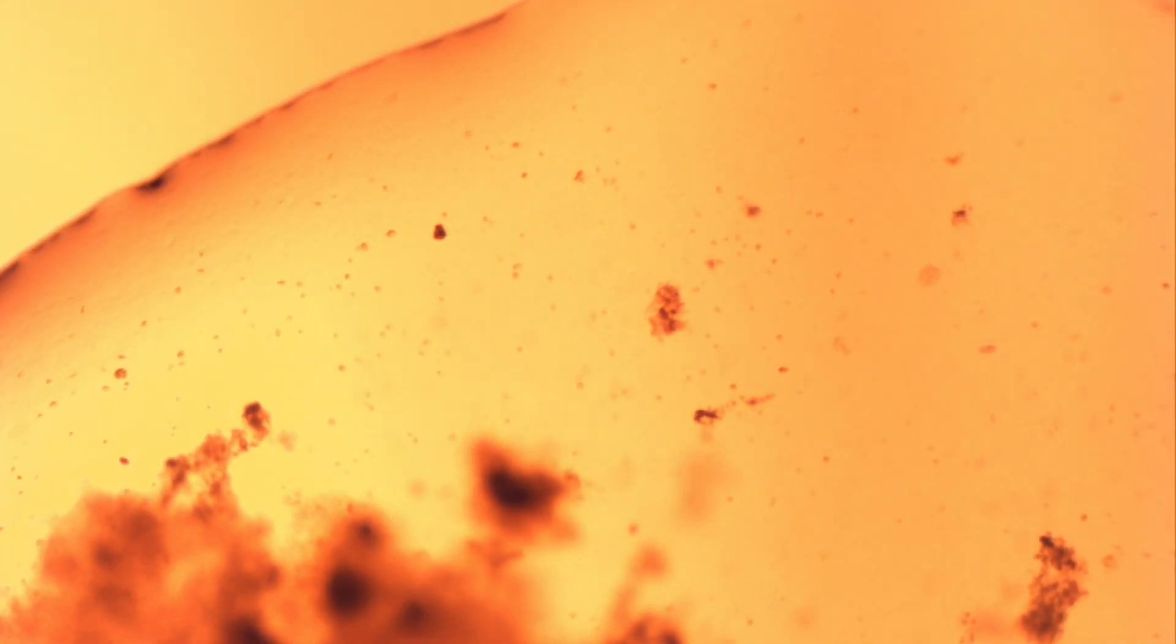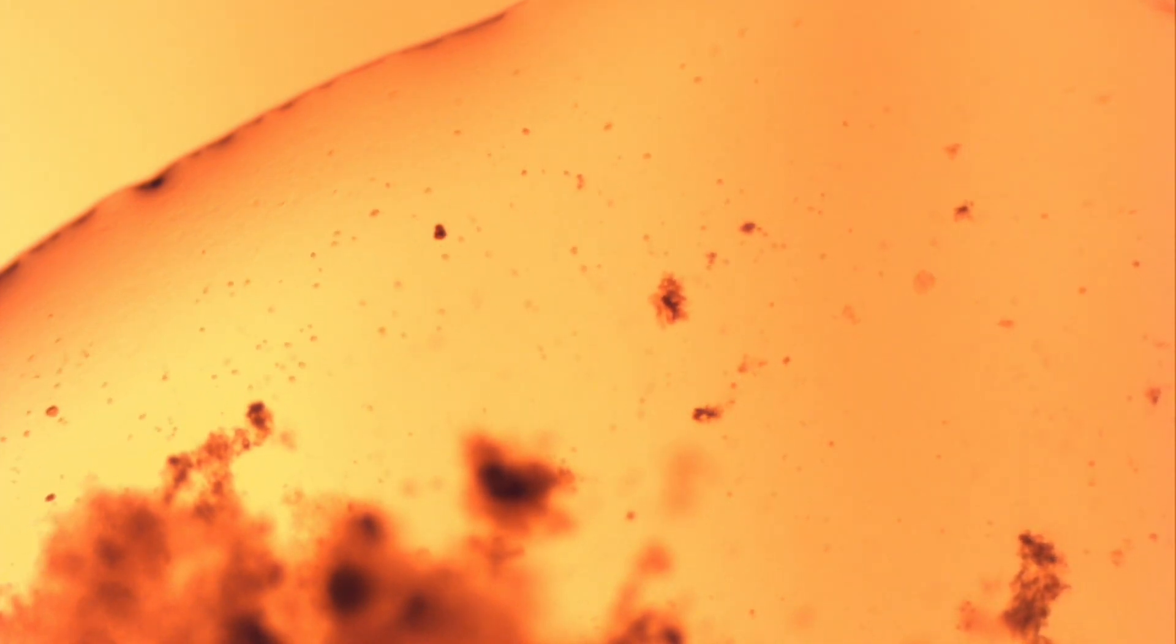It's not very effective, as it evaporates very fast, so only a small amount got into the water. Still, the small amounts were able to kill a fair amount of them.